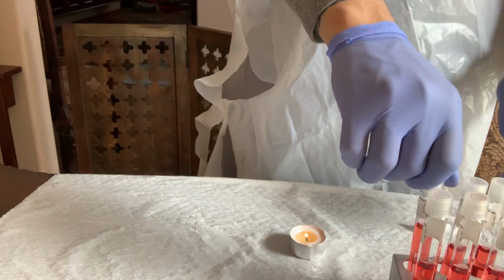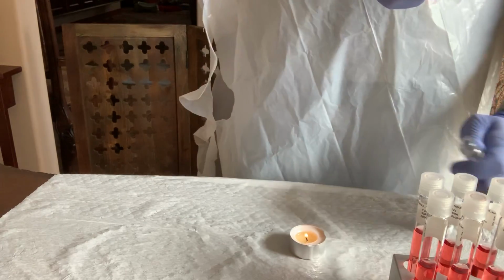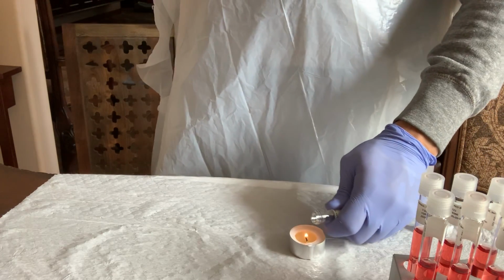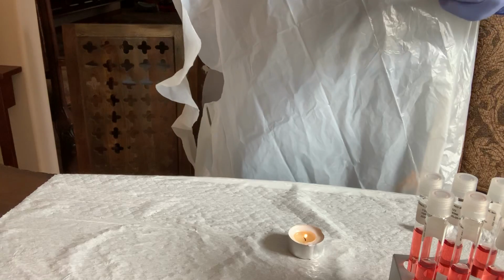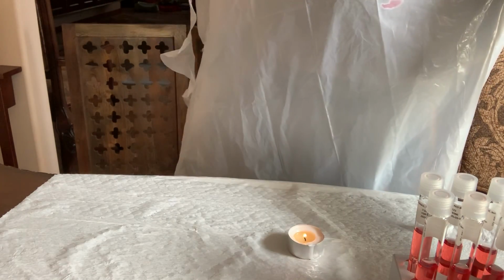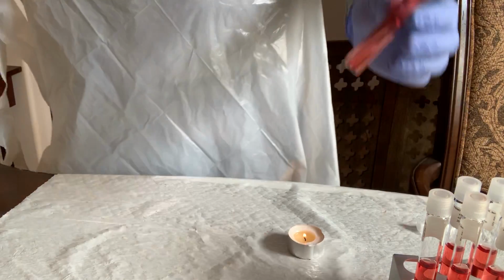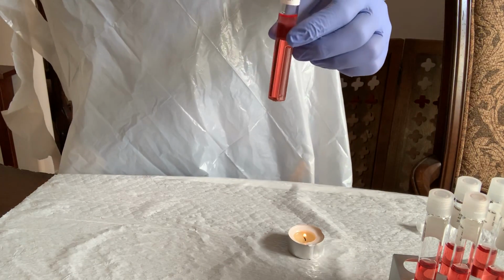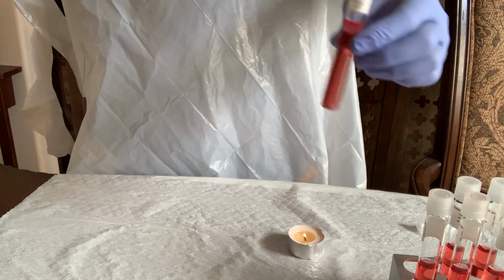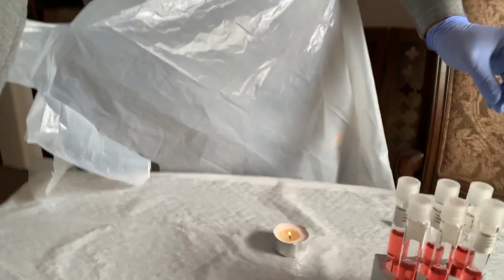And bam! We've got our first. Close this up. We now have our first sample in there. What you'll be able to see is we've got the Durham tube in there as well. So we'll just let that go. We'll label it, and then we'll get the other 5 moving.